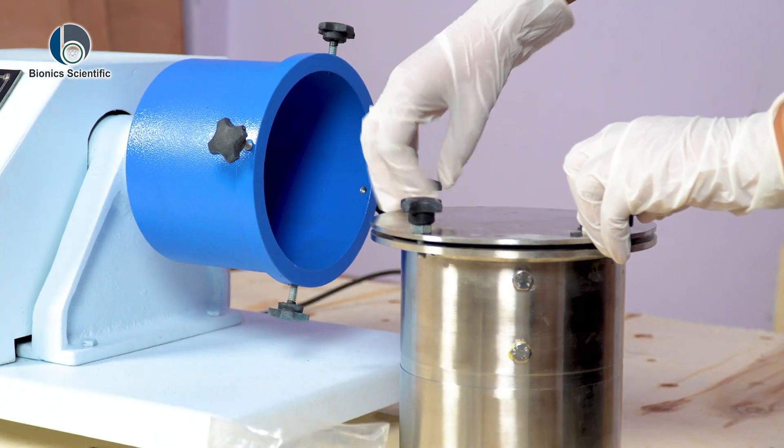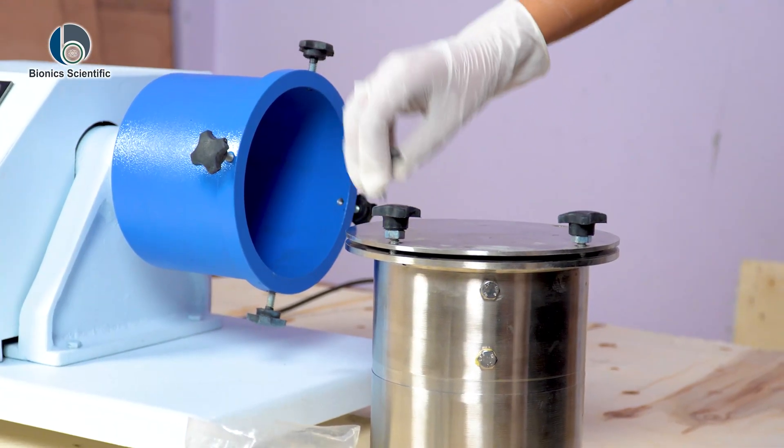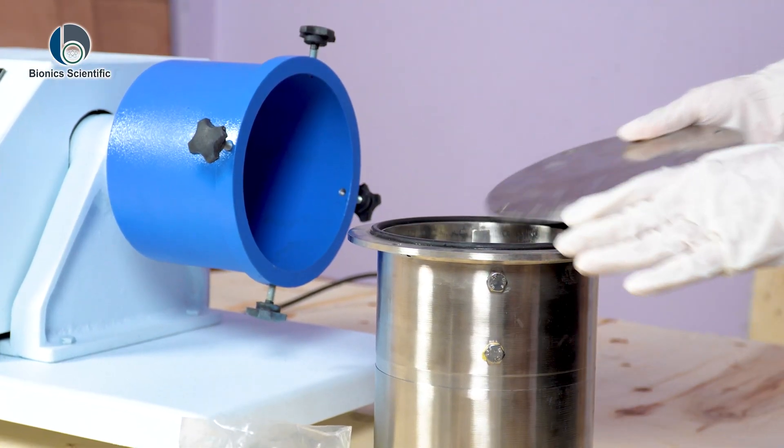The jar is built for long-lasting performance and resistance.